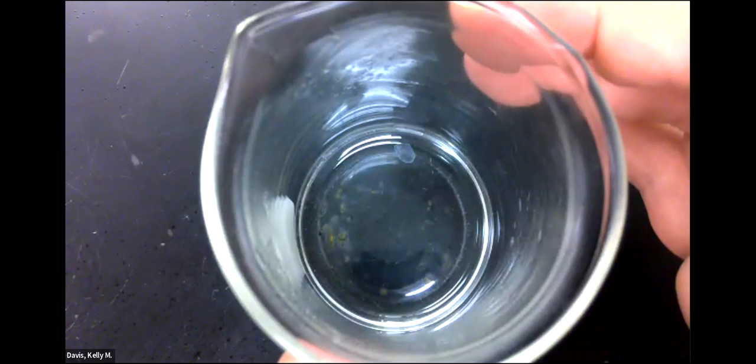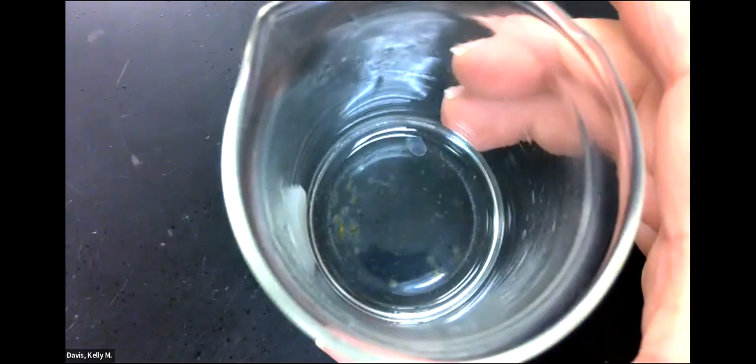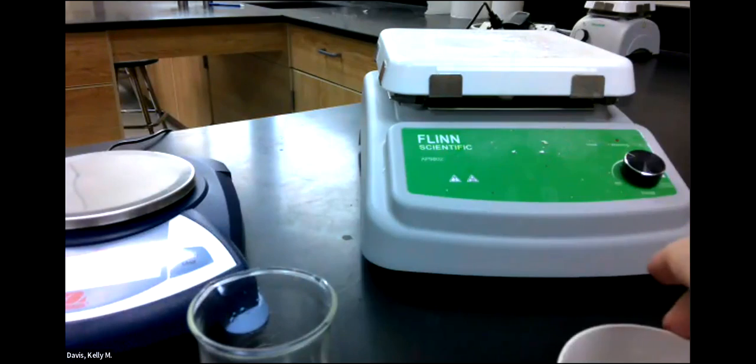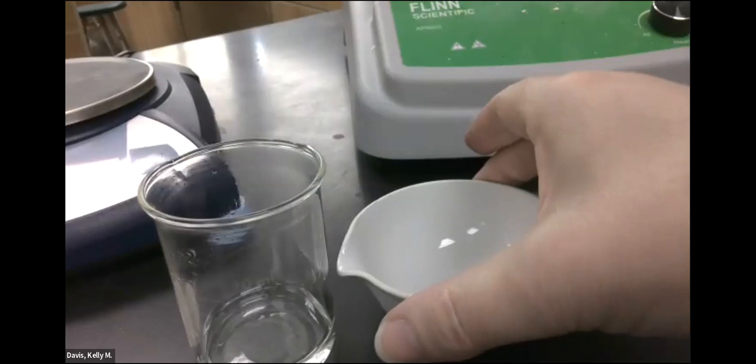It is primarily magnesium chloride, but we know that magnesium chloride is soluble in water. So what we want to do now is get rid of the water and record the mass of the magnesium chloride that we have left. To do that, I have a hot plate here, and I don't want to do it in a beaker because I'm worried it's going to get too hot and the beaker might break. So I'm going to evaporate it in what's called an evaporating dish, which is porcelain, made for high temperatures. I'm just going to set this on the hot plate.